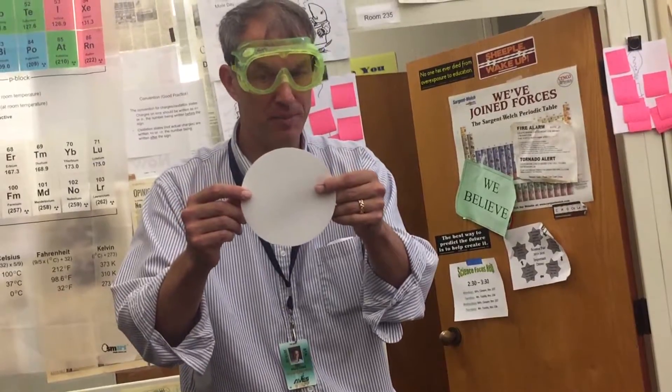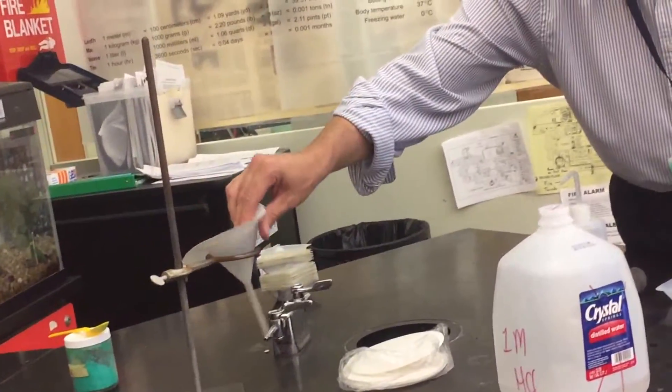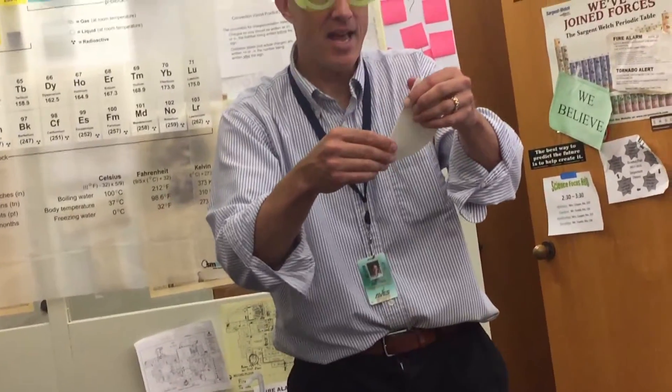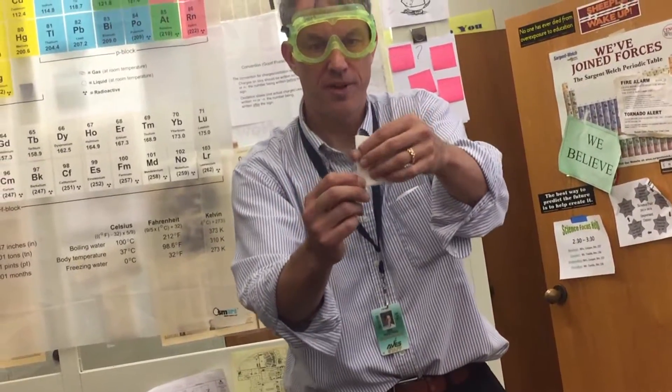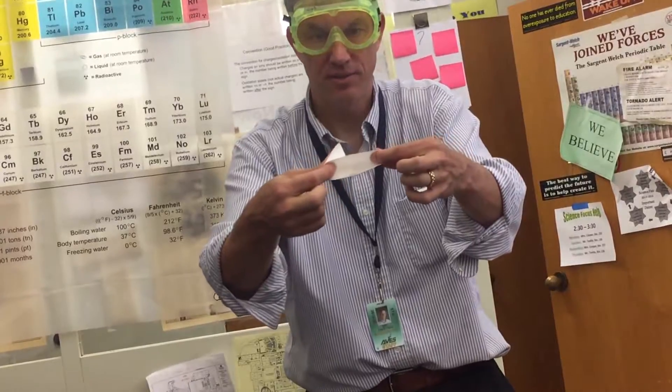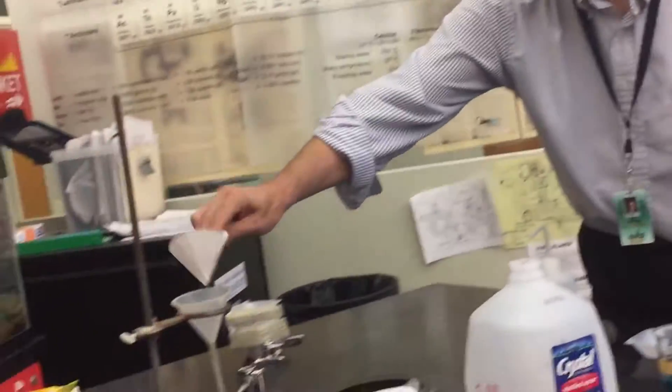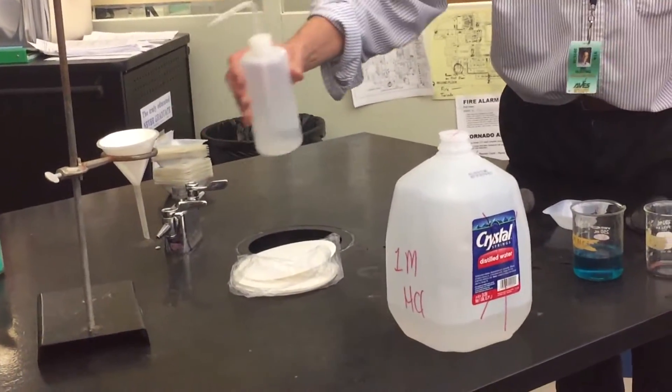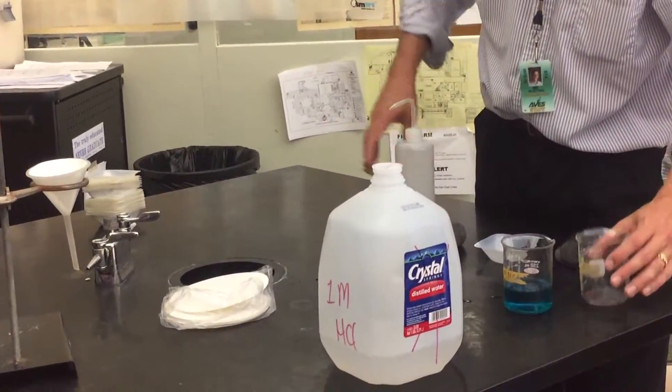Now, watch how we use the filter paper. If I put it in here like this, it's not going to work. Okay, so fold it in half. Okay, we fold it in half again. We get a quarter of a cone. Okay, we take this and you see a nice dome right there. That sticks in there. Give it a little bit of water so it sticks in there.